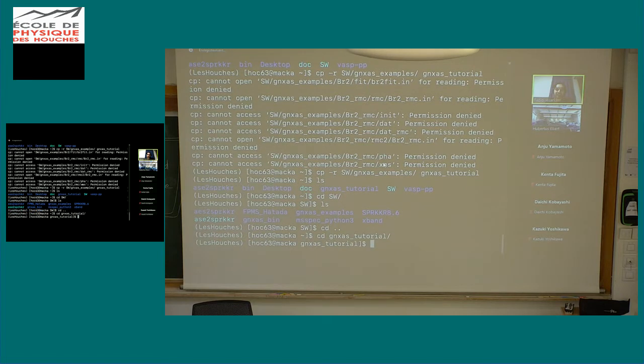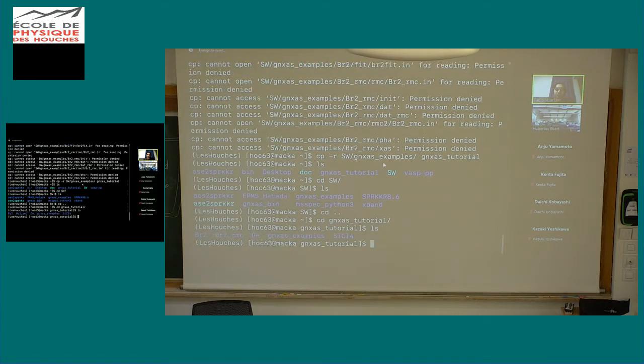Okay. So, Fabio, just a moment. I'll just make some small comment. If anybody asks questions in between, I think it is good to interrupt and then proceed. Yeah, sure. Feel free to interrupt me if you are behind or if you have questions. I mean, this is a hands-on. Okay, so we'll proceed then.